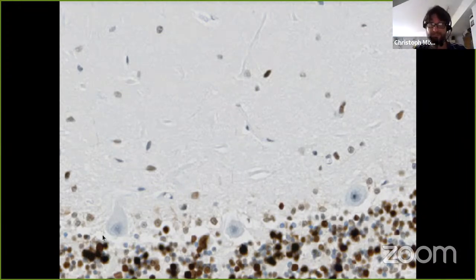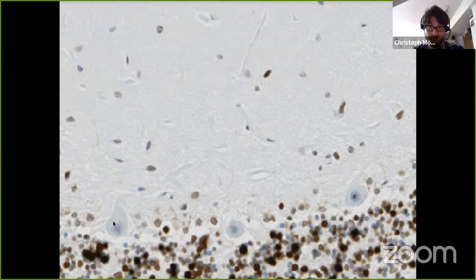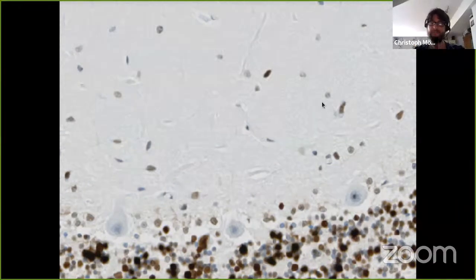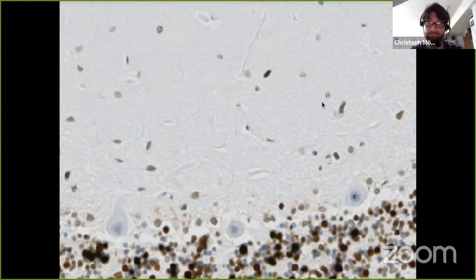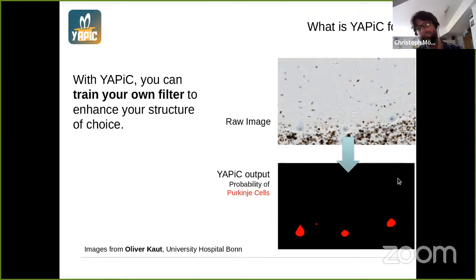To identify these image regions, you have to integrate a lot of different information. These cells have a certain location — they are always at this border of the tissue. They have a certain shape. They are a bit larger but don't have a different intensity. So you have to integrate information from a lot of different spatial scales. And this is exactly what YAPIC can do for you — you feed in this image and get an image where these cells appear as bright spots.